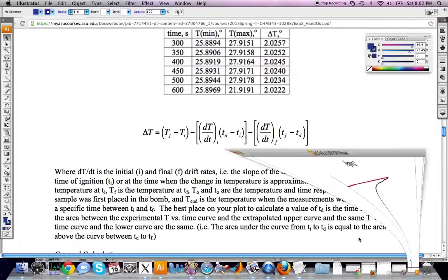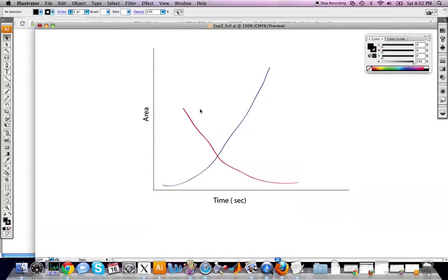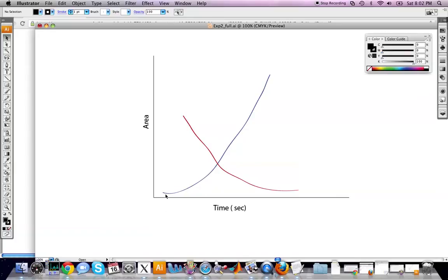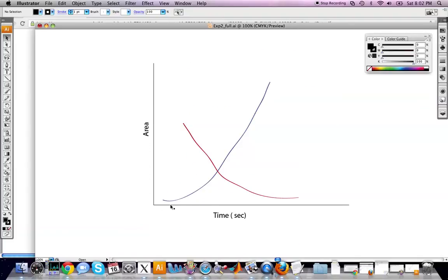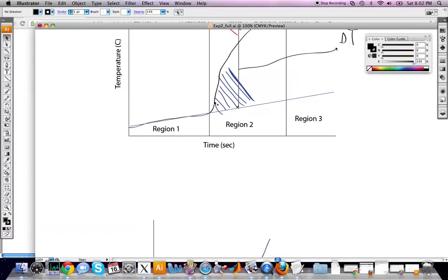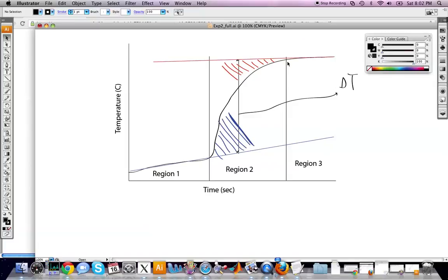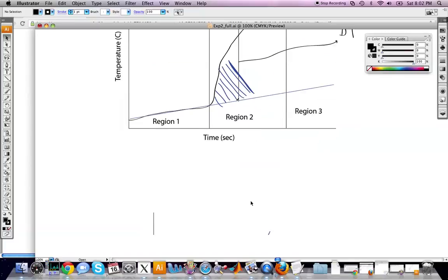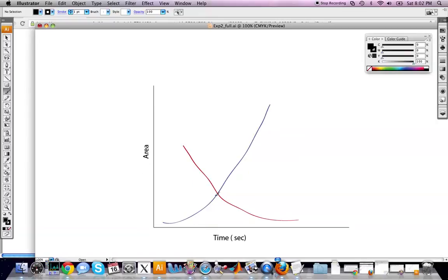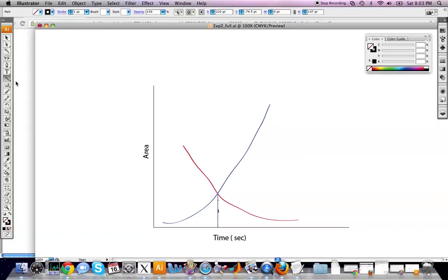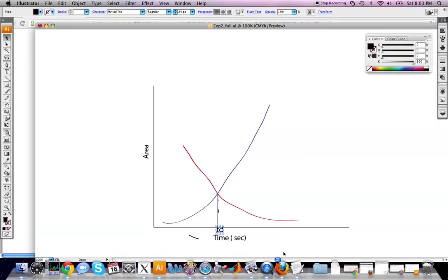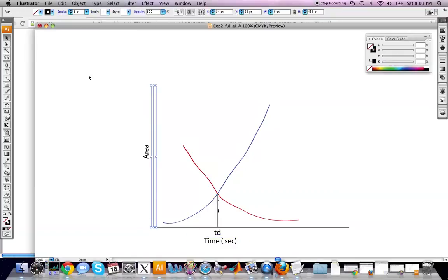We'll generate a plot of area versus time. The area in the bottom region increases from zero as time progresses. At low time periods, the area from the top is large and approaches zero at long times where the curves meet at the boundary of regions 2 and 3. The intersection of these two area curves gives us t_d on the x-axis. Now let's do this in KaleidoGraph.